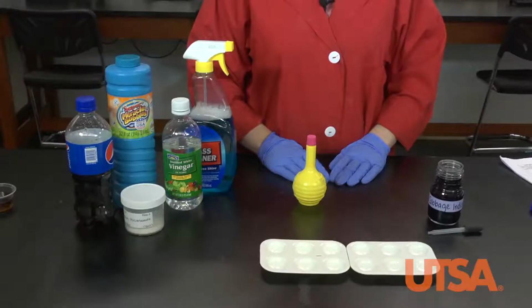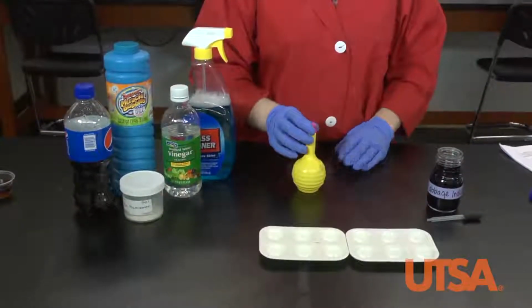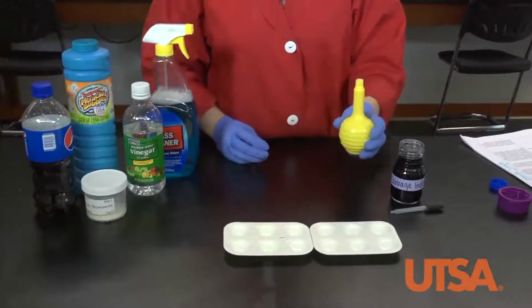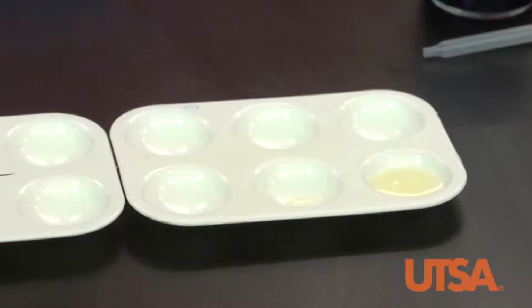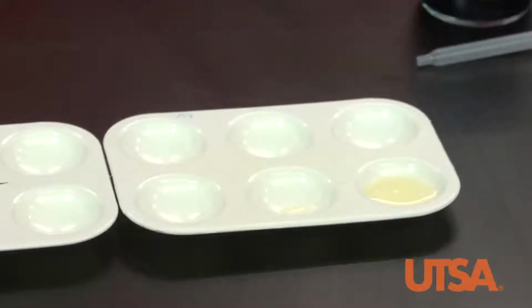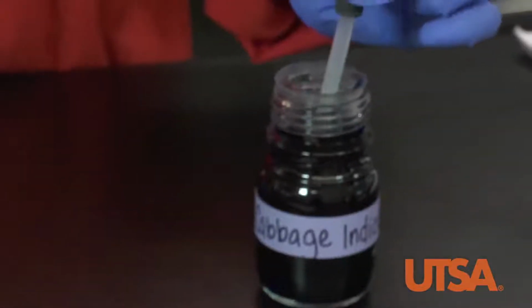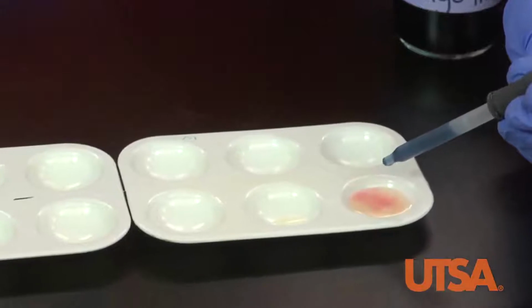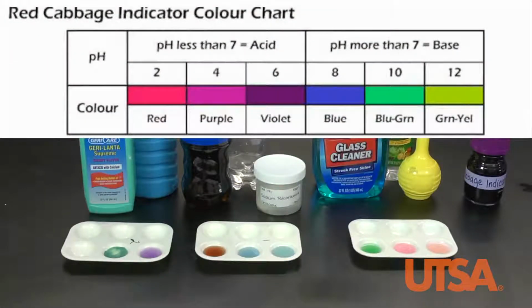Now that the indicator is prepared, it can be used to approximate the pH of various household items. To test a solution, place enough of your chemical into the testing dish, using a pipette or by pouring it. Then, using a clean pipette, place a few drops of the indicator into the solution. The color can be recorded and compared to our pH table to obtain a rough estimate of the solution's pH.